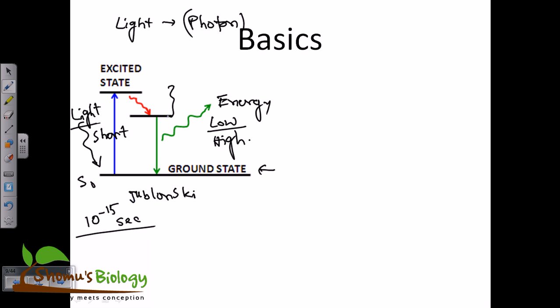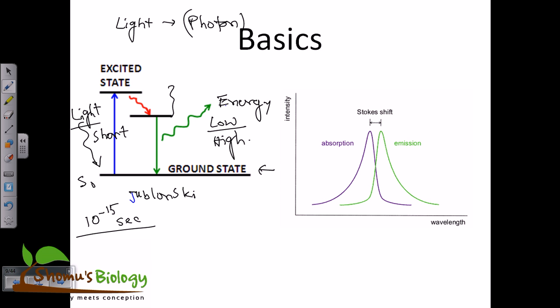So this is the fundamental concept of fluorescence emission. Now if we look at the intensity of this energy as well as the wavelength, for the emission as well as for the excitation, this is a very basic diagram, a graph actually. This graph is very important because on the x-axis we have wavelength and on the y-axis we have intensity, right? Whatever energy we provide, that is the absorption energy, its intensity is higher because it is at the top, but the wavelength is short.